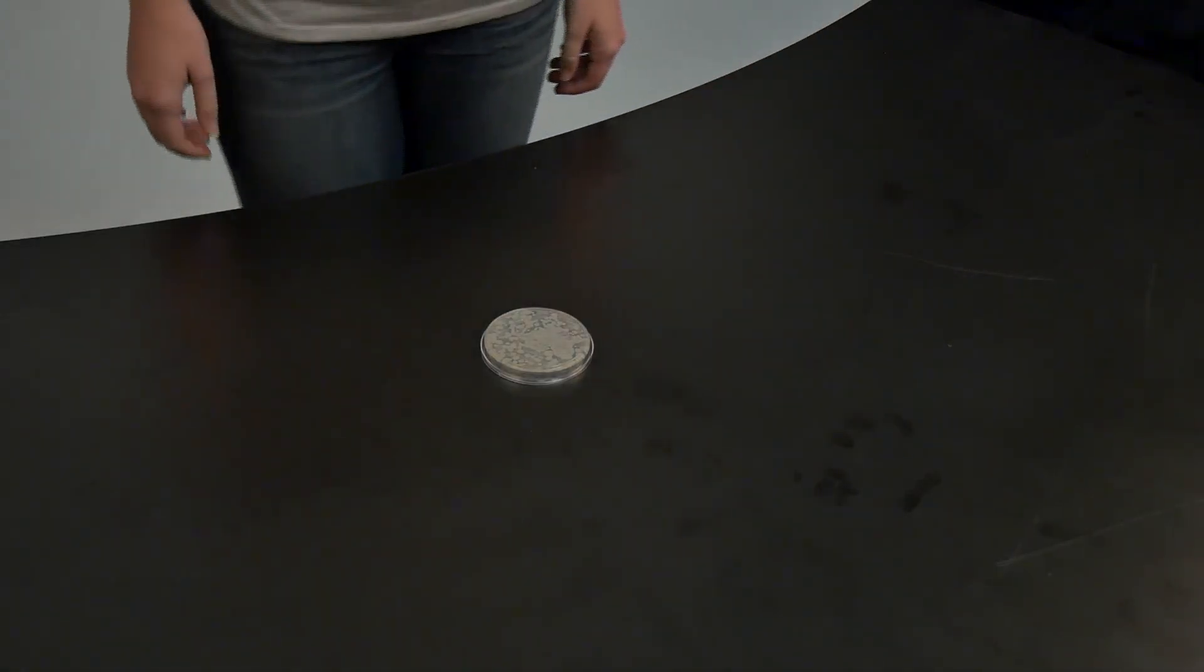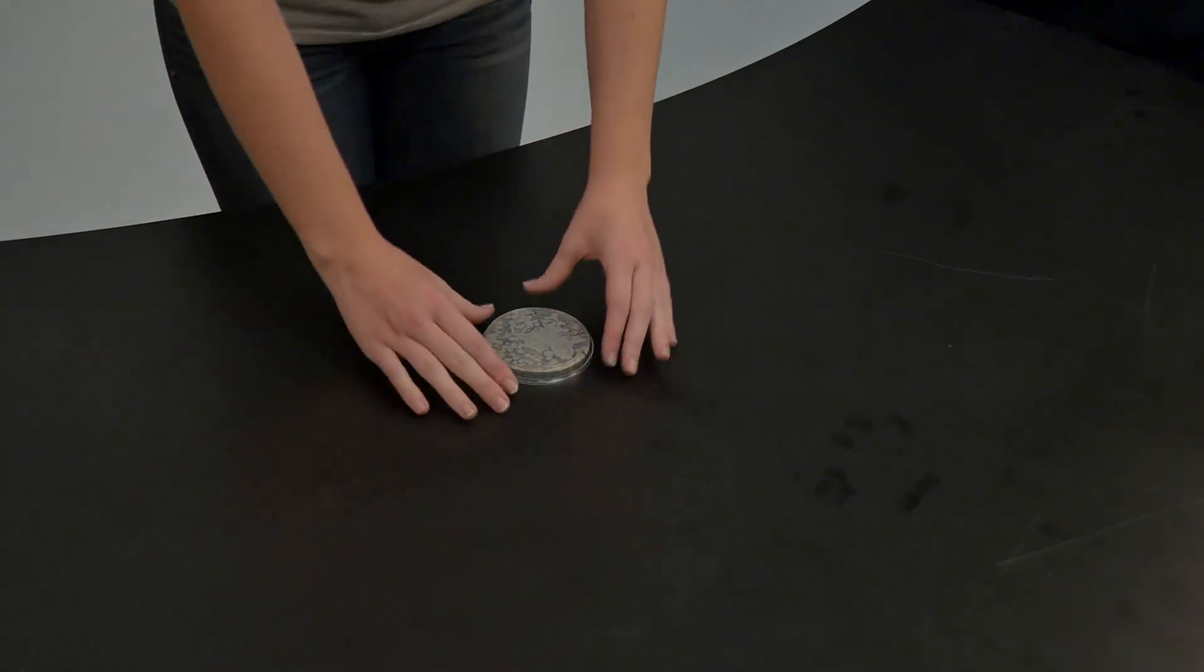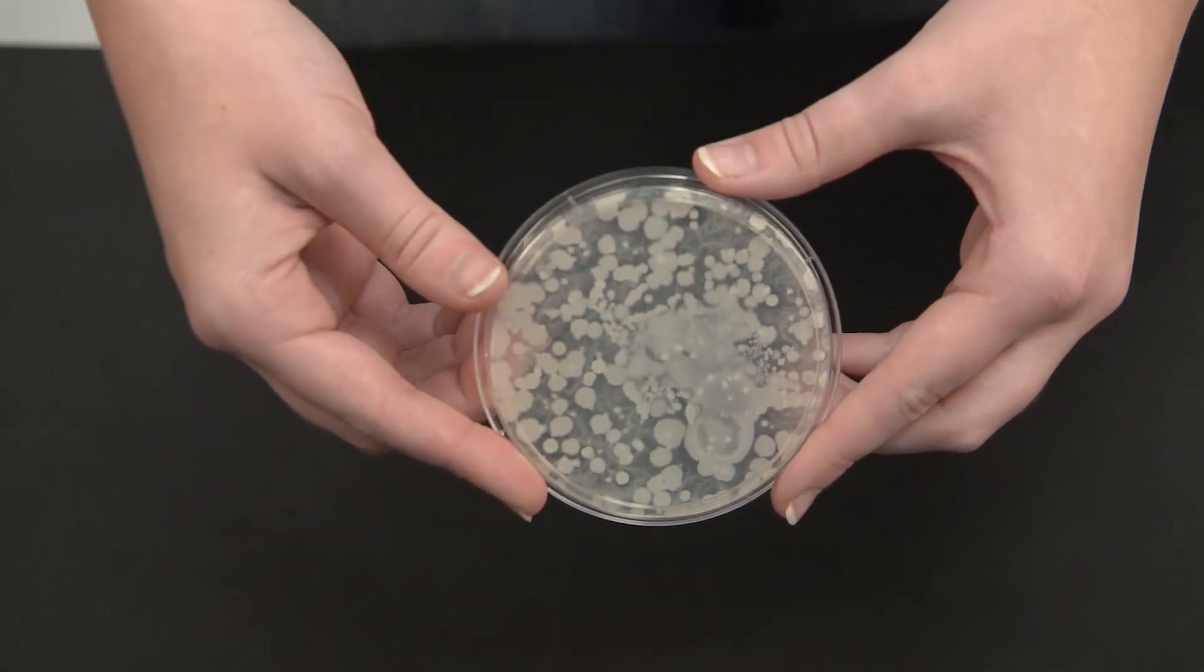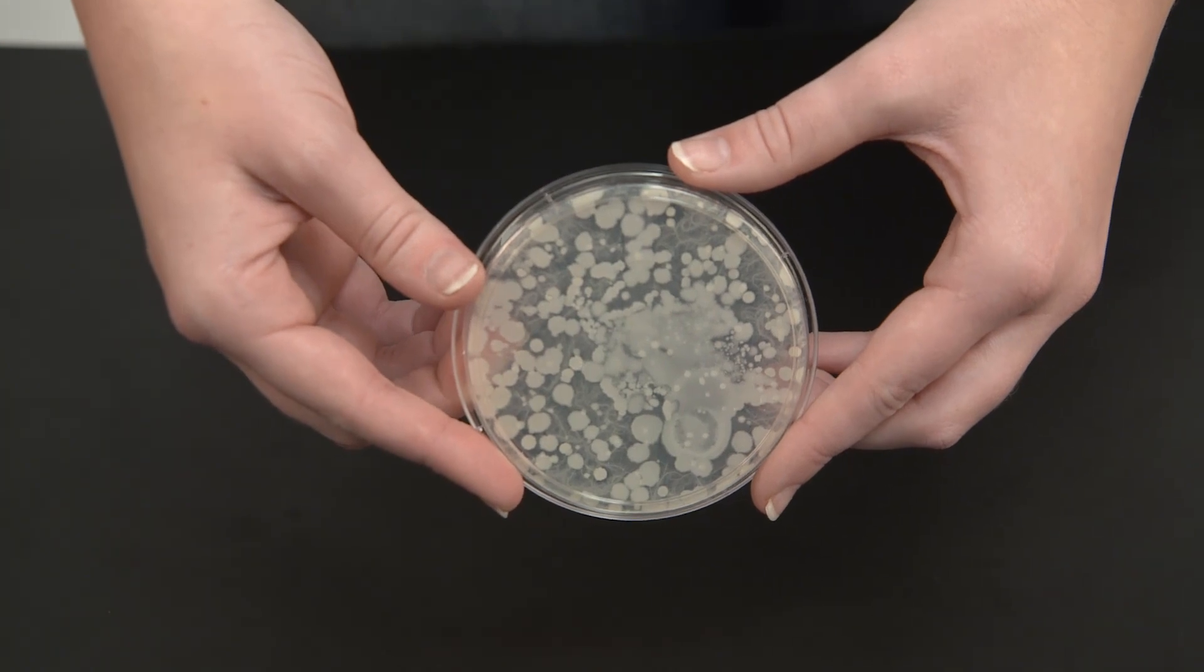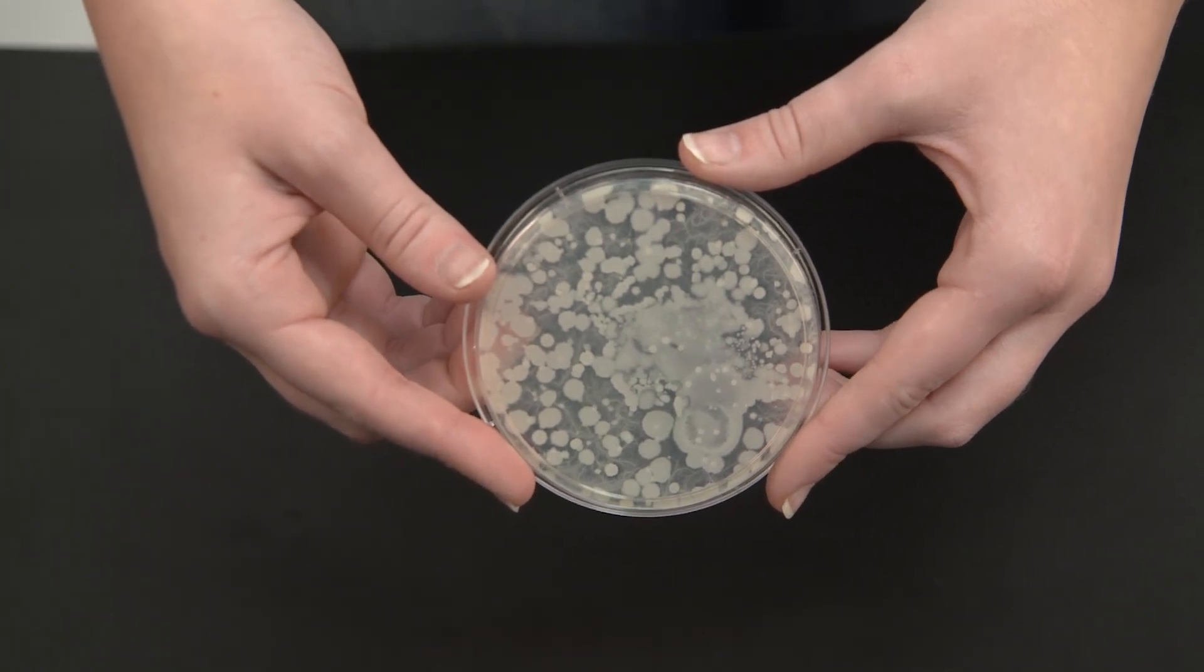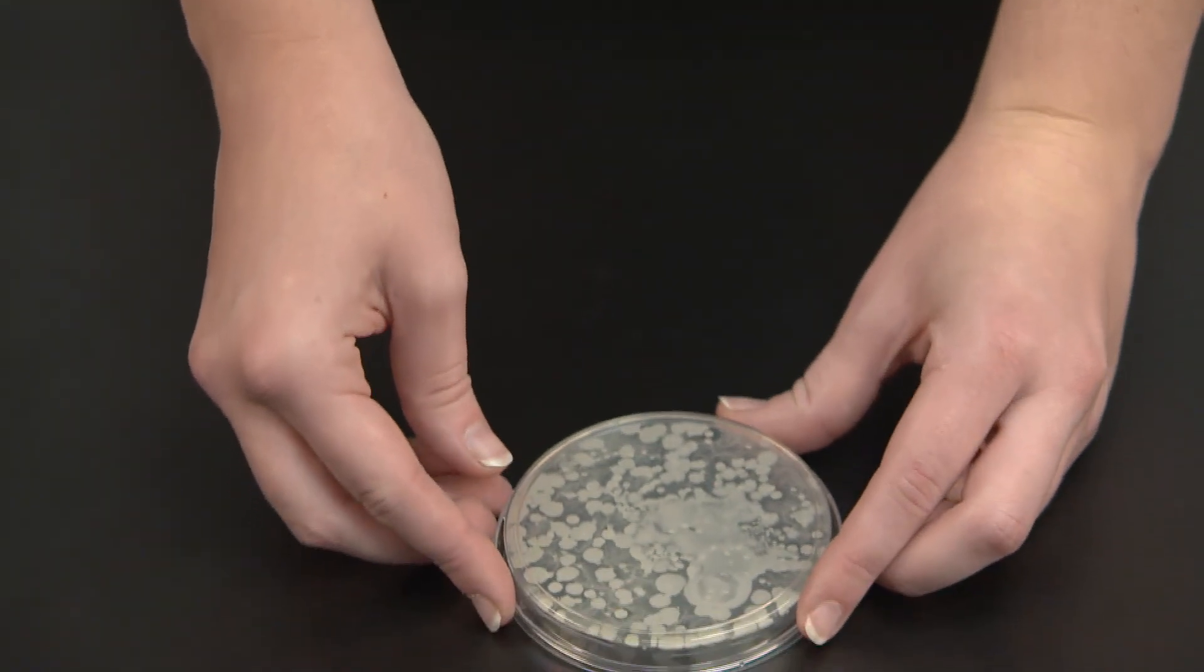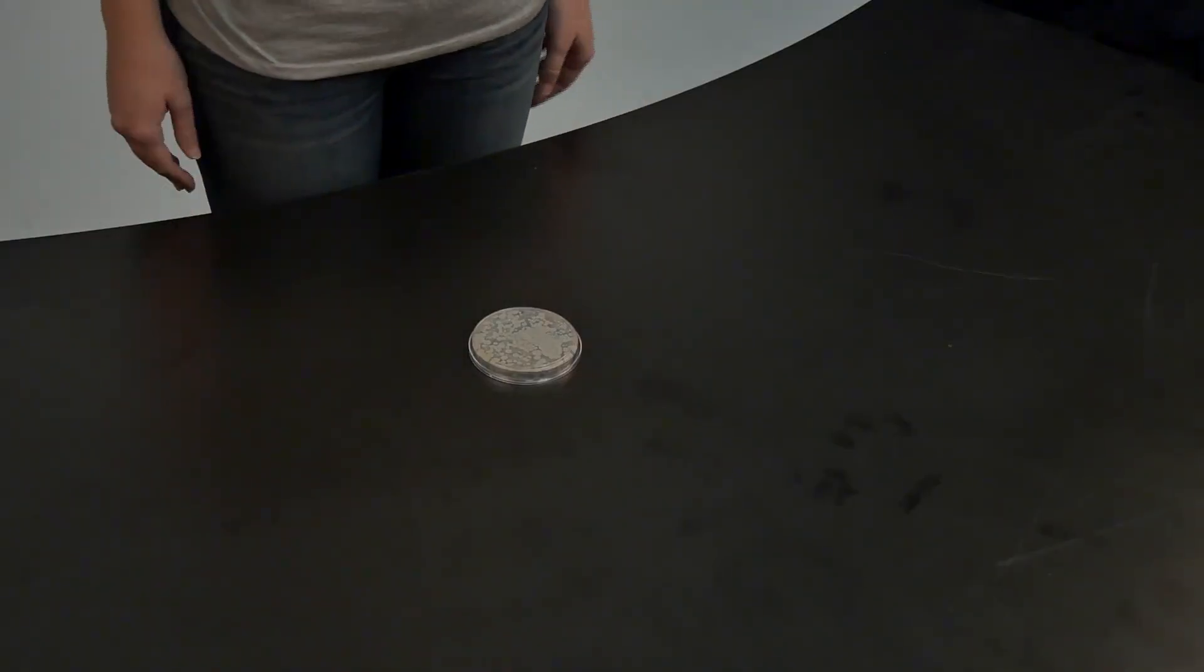There are many ways to measure the growth of bacteria. One of these is just to count the bacterial cells. Because there are so many bacteria in one gram of dirt, if we just spread the dirt on a plate, the bacteria will grow so close to each other that we won't be able to see individual colonies.